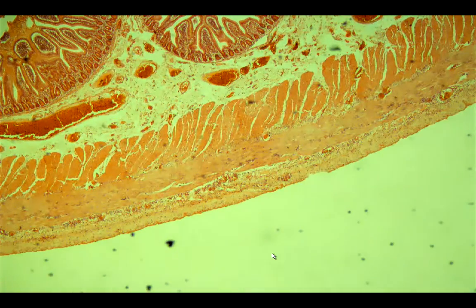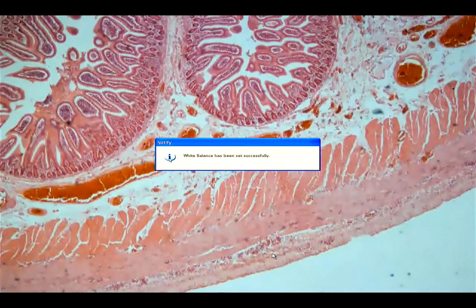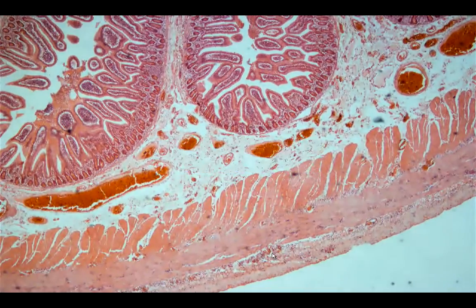Okay, they have elongated nuclei. Okay, these are cells that do not have cross striations. Okay, so this is smooth muscle for the jejunum. Okay, so those are the slides that we have for the muscle histology.